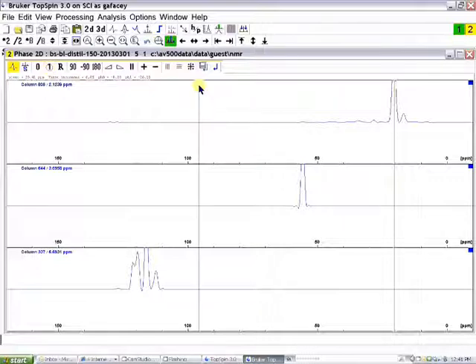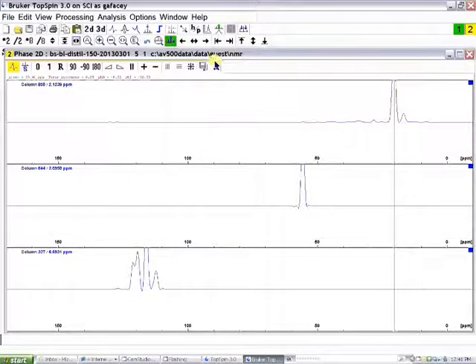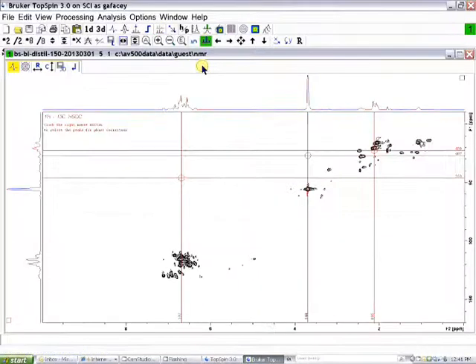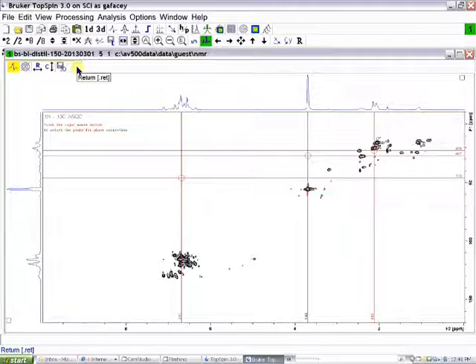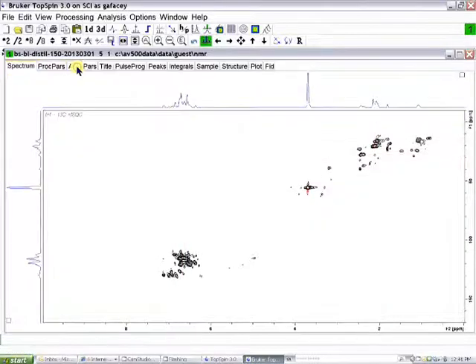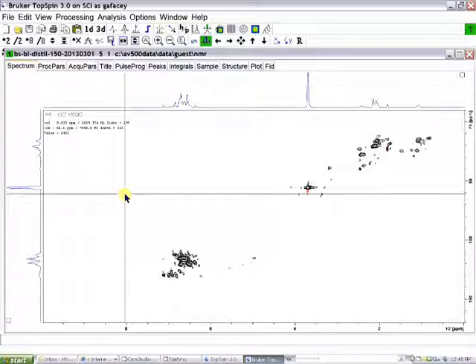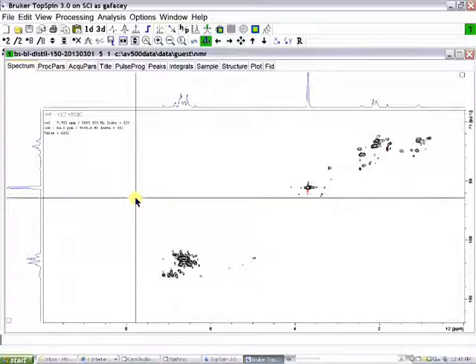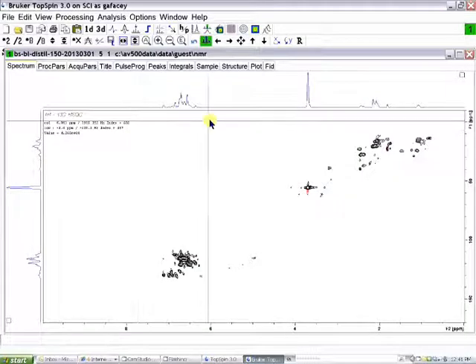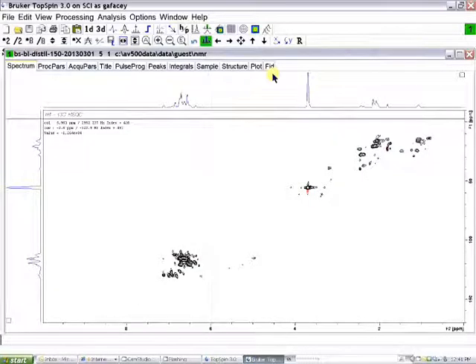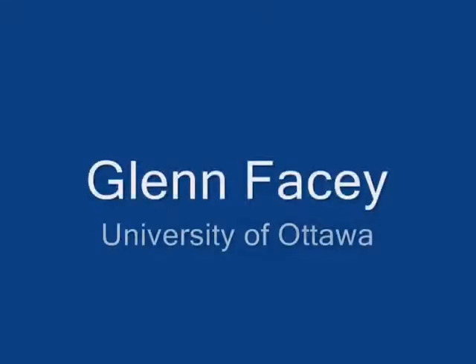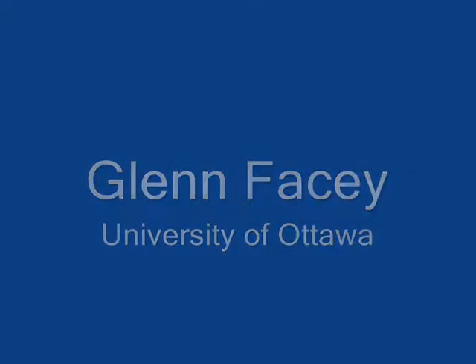The spectrum in the middle, you can see, is in phase. I go Save and Return. And now you can see that the spectrum is in phase. I now have an HSQC spectrum that is in phase.